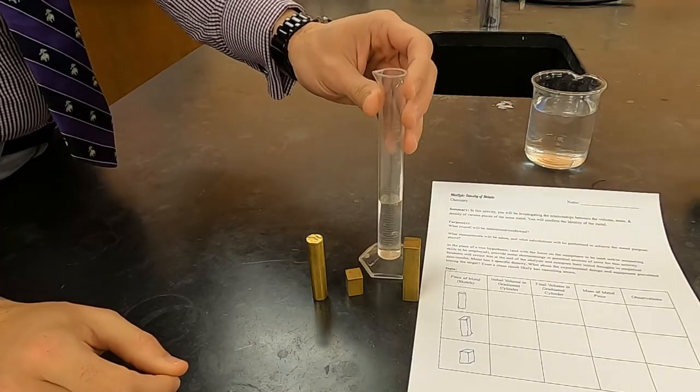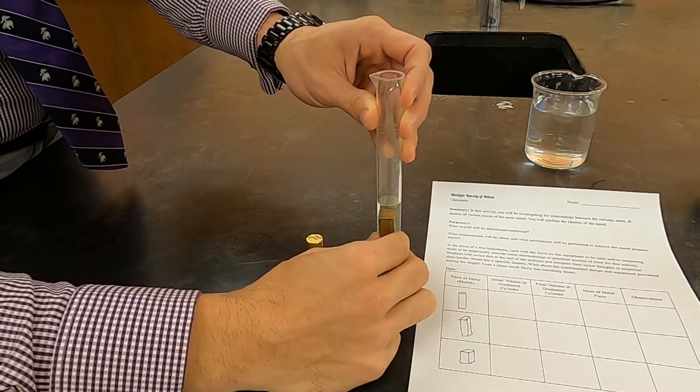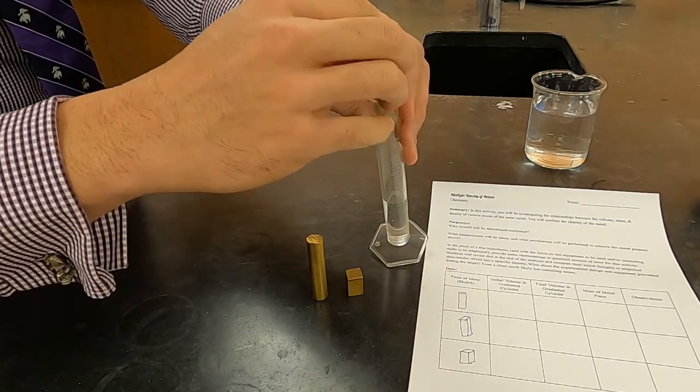When you're filling up your graduated cylinder for water displacement, you'll want to make sure that the water level is at least as high as the piece of metal. We're using graduated cylinders where the piece of metal will still fit in.